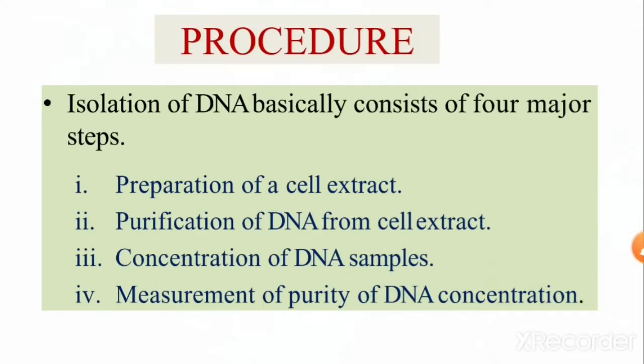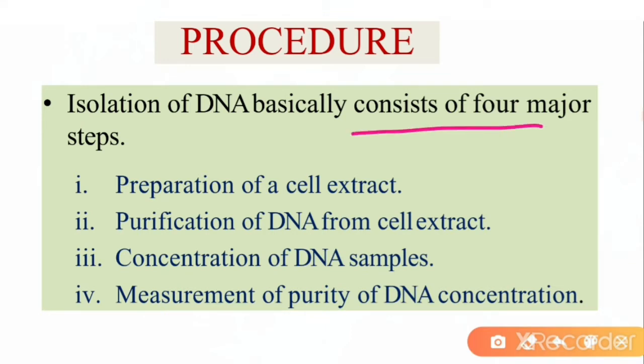Now, the procedure. The isolation of DNA basically consists of four major steps. First is the preparation of cell extract. Second, purification of DNA from the cell extract. Third, concentration of DNA samples. And fourth, measurement of purity and concentration of DNA.